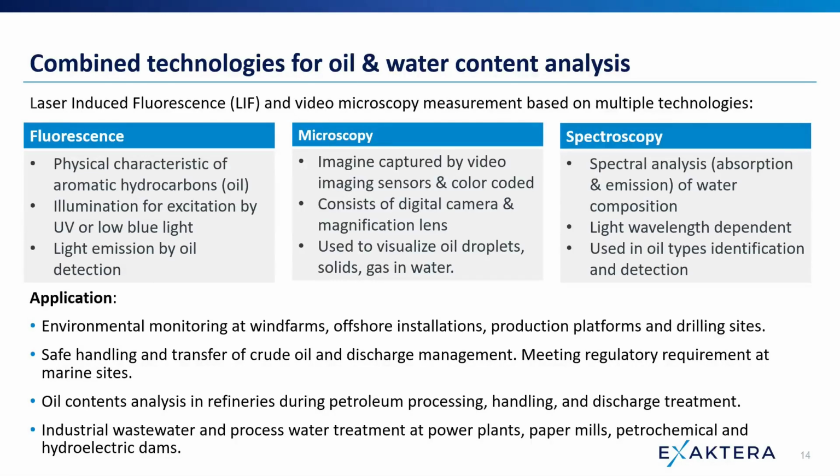To measure absorption of light across a range of wavelengths and identify the precise chemical composition of the hydrocarbons present, and to image droplets for size determination. These optical methods together allow for continuous monitoring of hydrocarbon production and supply facilities, as well as ensuring that water treatment plant is operating effectively either for drinking water supply or for industrial wastewater treatment.